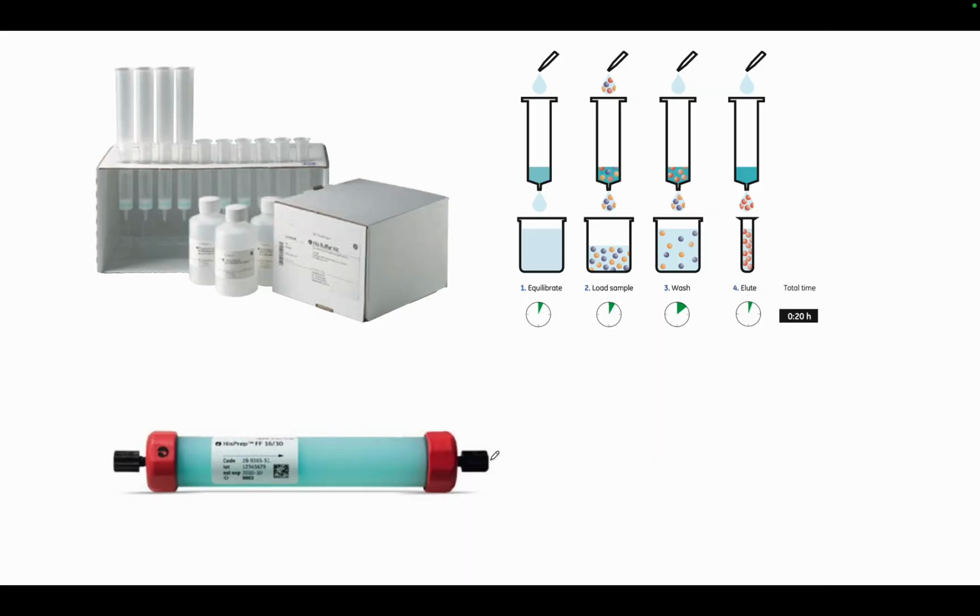Most commonly you would get the resin as beads which are stored in ethanol, and then you can use it in a gravity column like this. You take out some of the beads, put them into your gravity column, and they will settle at the bottom over here. Then you can pass your purification buffer through this, and that will cause all the beads to settle properly at the bottom of the column. Then we can add a sample. As the sample is passing through the column, it will bind to the nickel NTA groups and be immobilized, and all the non-specific proteins will pass through.